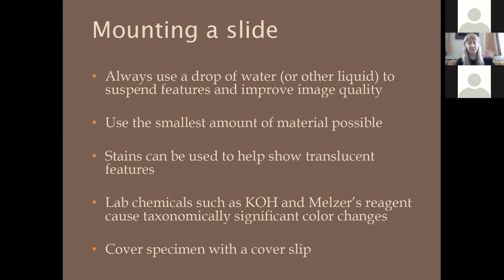For some stains, just putting the drop on there and putting your fungal material into the stain is fine. For some things, you want to actually stain the fungal material with the stain first, and then soak it all up with a paper towel or something like that, and then put water onto the slide so that you're not getting too much concentration of dye.